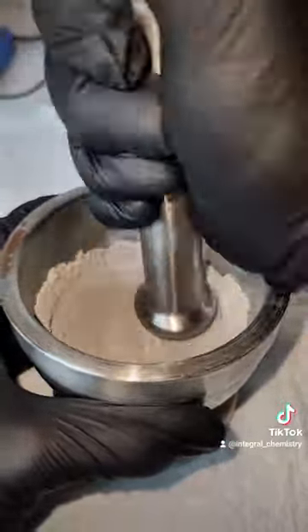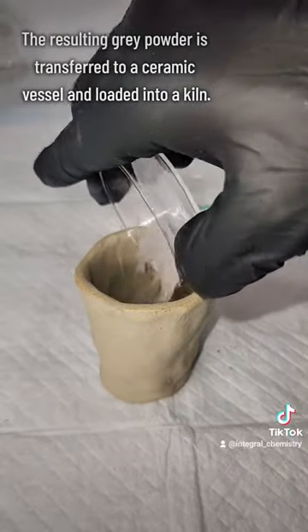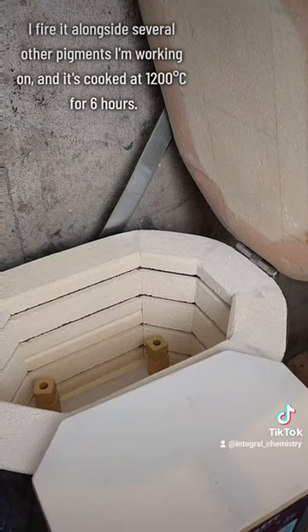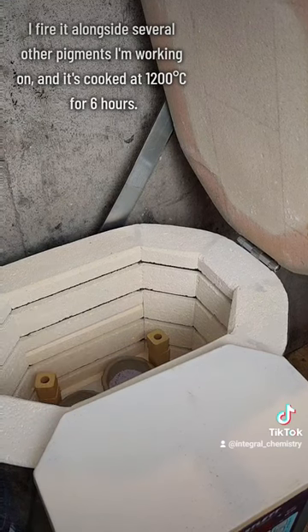The resulting powder is a light gray, and I transfer it to a ceramic vessel and then load that into a kiln. In order to fully react, this mixture needs to be cooked at 1200 degrees Celsius for 6 hours, and since I didn't want to run a kiln for just that, I'm loading it alongside several other pigments that I'm currently working on.